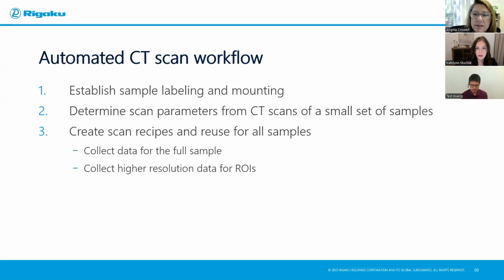And generally, the micro CT instruments will have a mechanism to do this. In ours, they're called jobs. And in that case, we can reuse the same job over and over again to make sure that we always are using the same parameters. And we may want to collect more than one scan. So consider that when setting up your workflow.